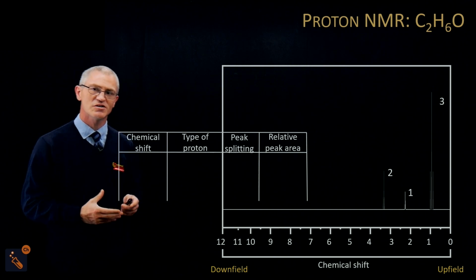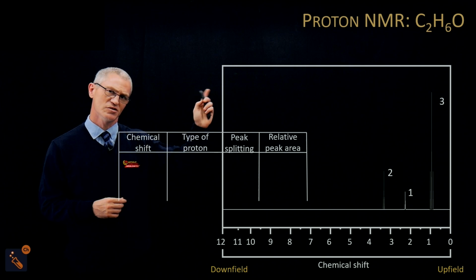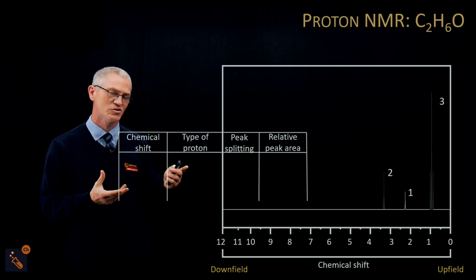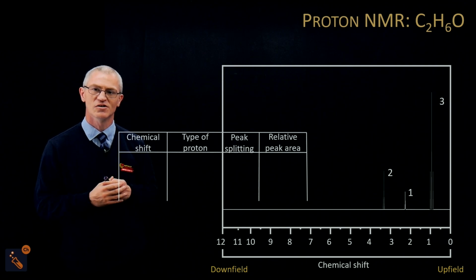Now, it's always worth, when you look at these things, to have a little idea, a little guess, first of all, to see whereabouts you think it might be. So, for example, this is very likely to be an alcohol because it's so simple. But let's have a look, shall we?